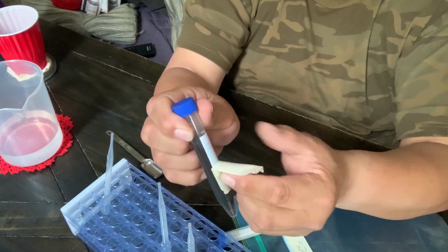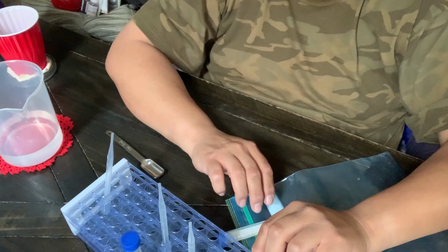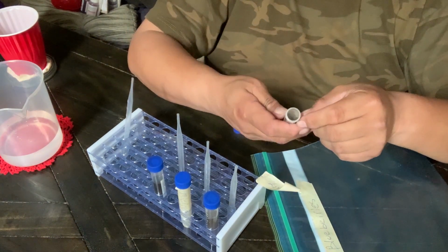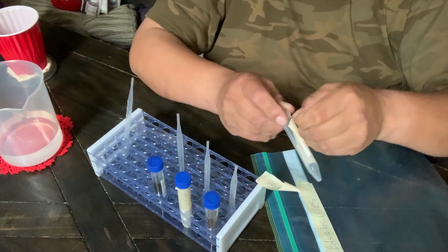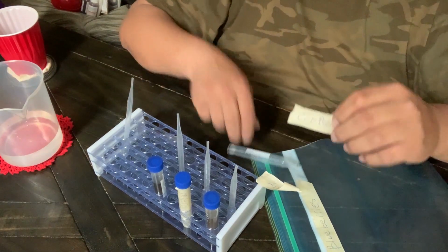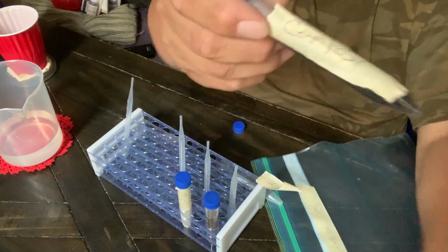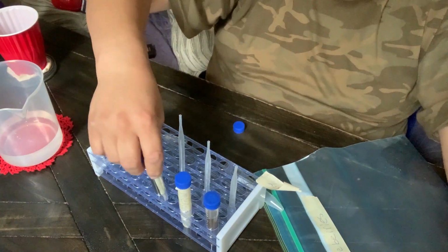Just grabbed the wrong test tube. No big problem, as long as we know what things are. So let's put that there. And then this one says compost. And this one belongs to the other one. So it's just masking tape, very easy to take off. All right, so this one, compost. And you see, no cross contamination, no nothing, easy fix. It's like I did that on purpose.